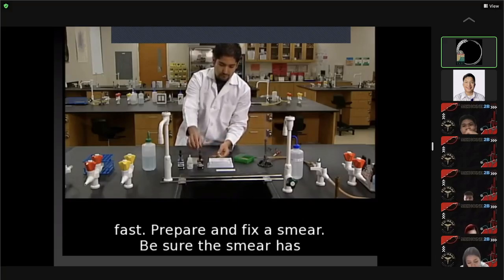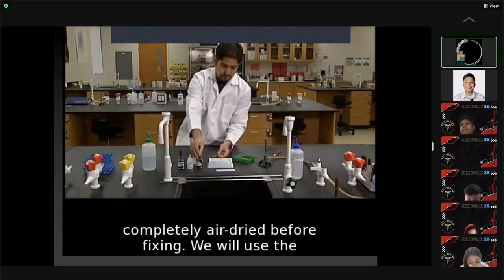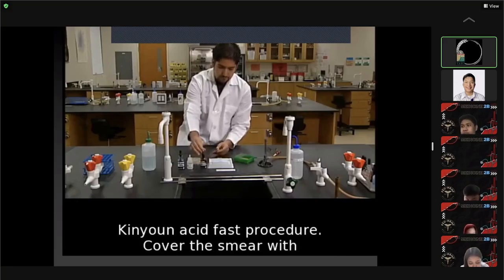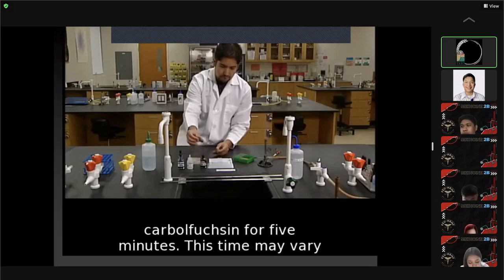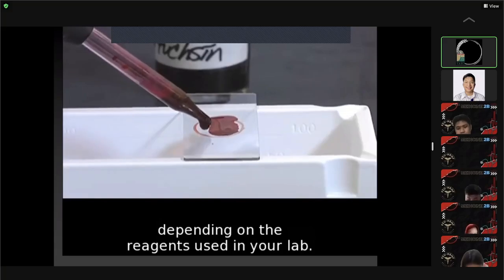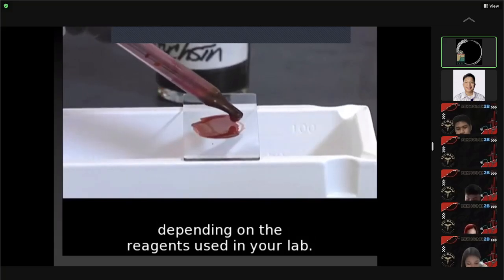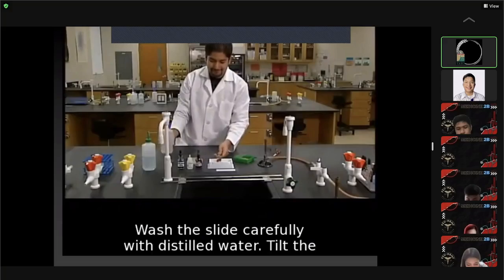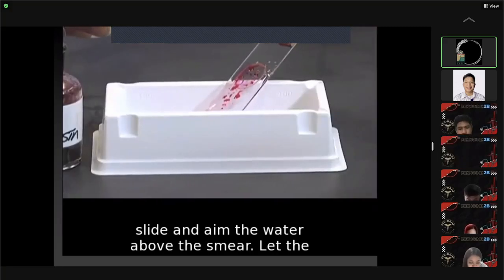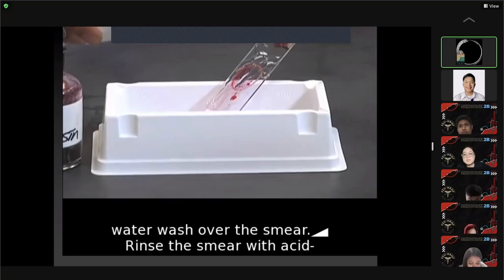Prepare and fix a smear. Be sure the smear has completely air-dried before fixing. We will use the Kinyoun acid-fast procedure. Cover the smear with carbol fuchsin for 5 minutes. This time may vary depending on the reagents used in your lab. Wash the slide carefully with distilled water. Tilt the slide and aim the water above the smear. Let the water wash over the smear.